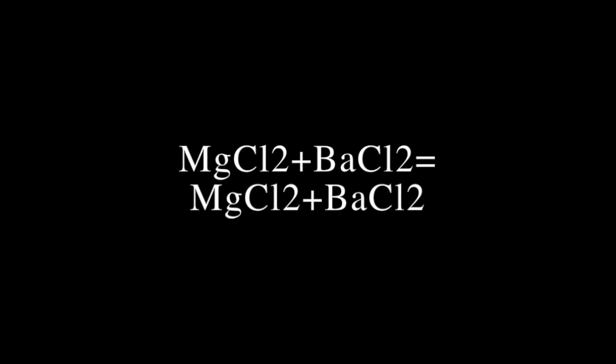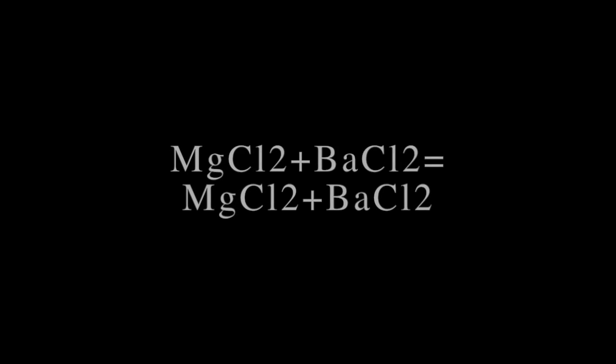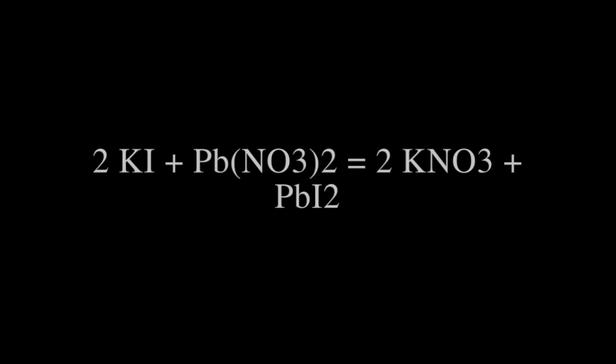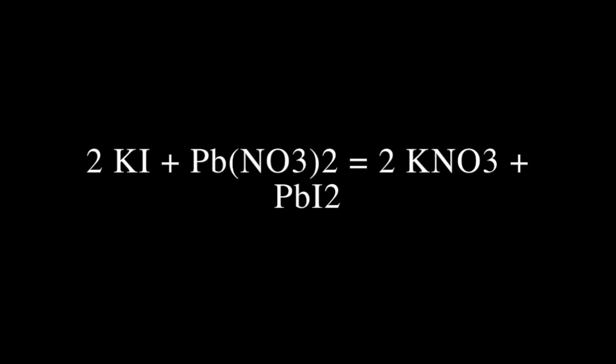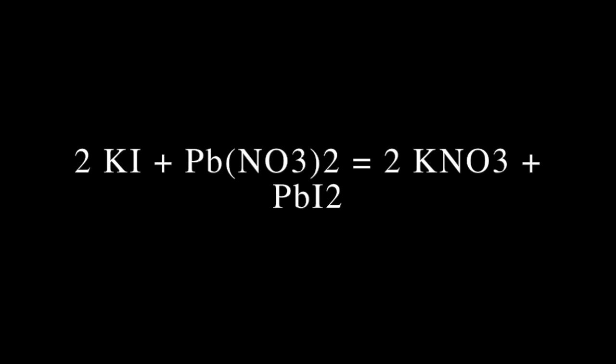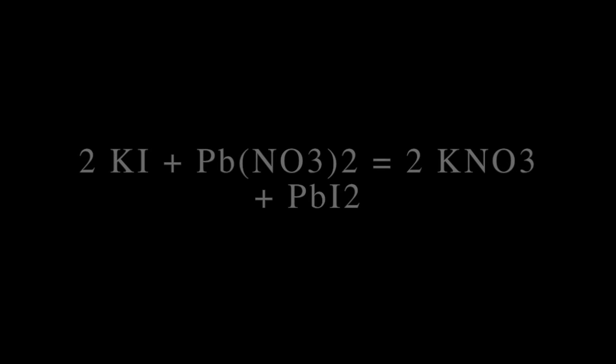One of the reactions that we formed was the lead nitrate plus the potassium iodide that gave potassium nitrate plus lead iodide. In this case, the lead iodide is a precipitate formed, which indicates that it is not soluble in water according to the rules of solubility. The drop formed by this reaction was a concentrated yellow color.